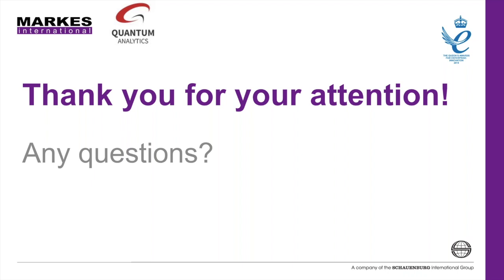Absolutely. And this actually might be a similar situation for this next question. Can you provide detailed column specifications for the FID MS analysis? Yes, we can. I won't give them out here because we've got different configurations depending on your GC instrument as well. So Lauren, if you've got the details, we'll get in touch after the webinar.